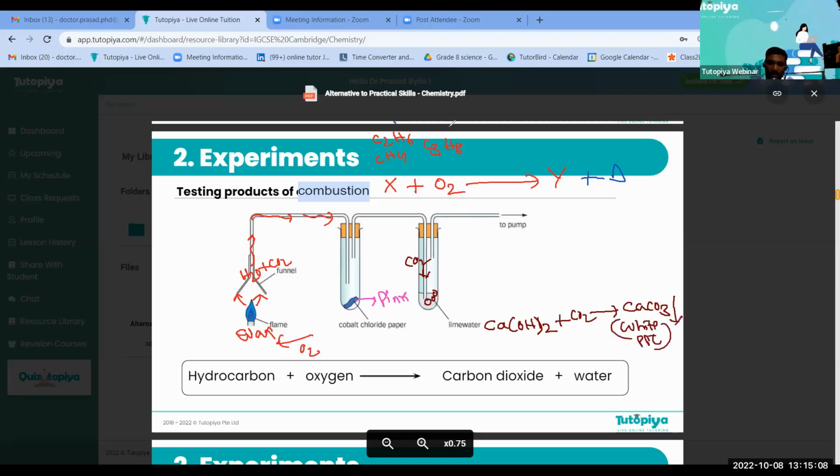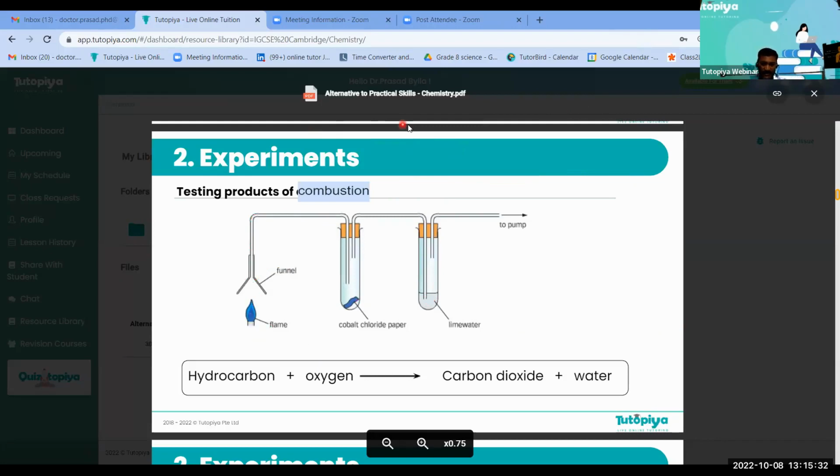white precipitate. So as long as you pass carbon dioxide, you can just take a glass, pour some lime water, and put a glass tube or a pen refill in it. This is a pen. I just blow some air through it, because you exhale carbon dioxide, and the lime water turns milky white. Now I'll show you a real-time experiment of what's actually happening.